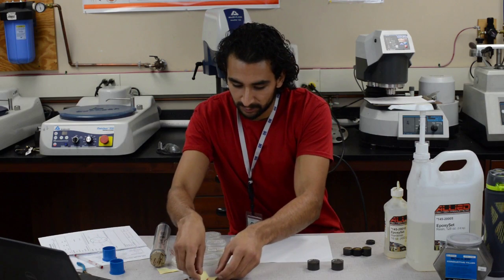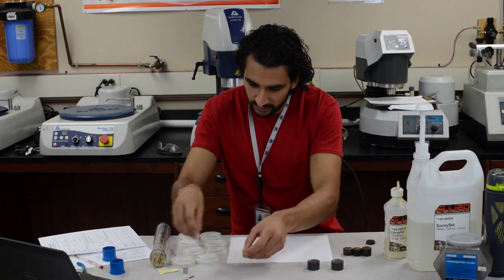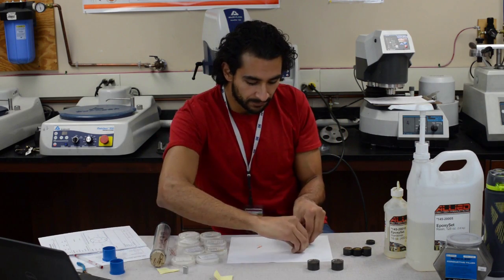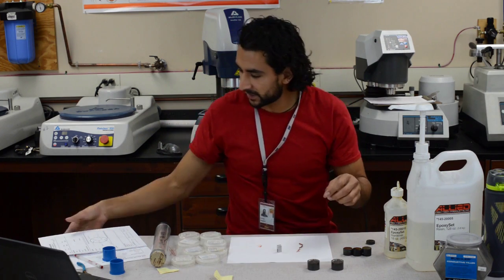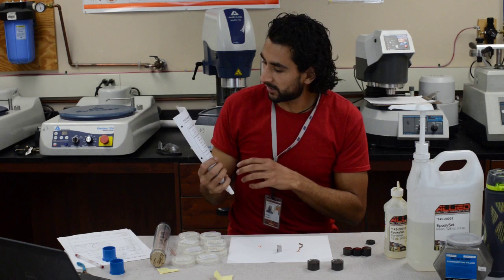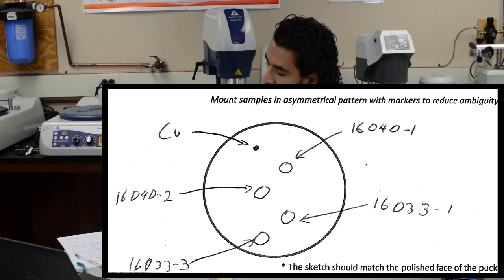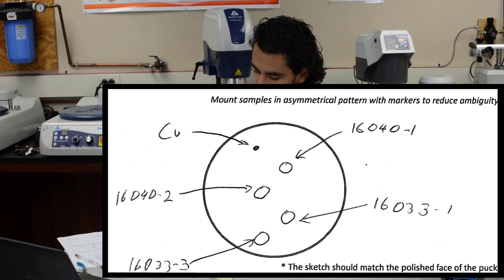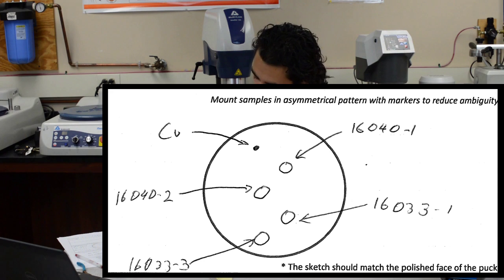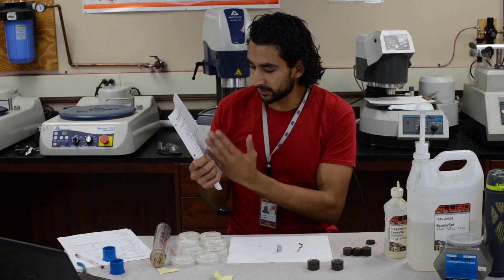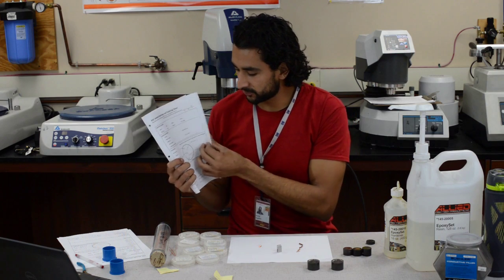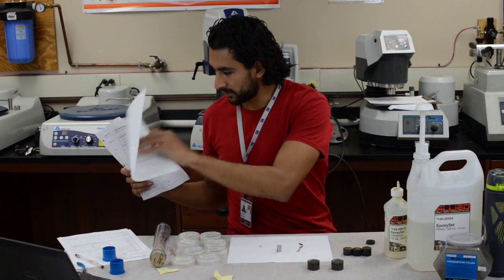So whoever grabs this sheet later on will know exactly what the puck is. And so I've laid my samples over here, and this is how I want to mount them actually. I've made my diagrams, and here you have this one for sample 38. And we have the bigger guys, the thicker guys in kind of a zigzag pattern. And you need to keep in mind, again, the left to right thing. You'll see when I mount them what I mean by that.